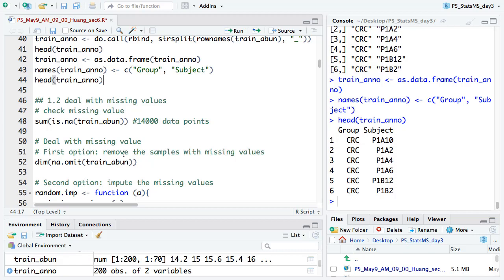One common problem when you have protein abundance data is missing values in the matrix — especially if you do DDA, that's quite common. Even this target analysis dataset still has some missing values. For classification, there should be no missing values, because you need to use protein information to predict the state of each sample. If there's a missing value, you can't predict it. So we need to deal with missing values.